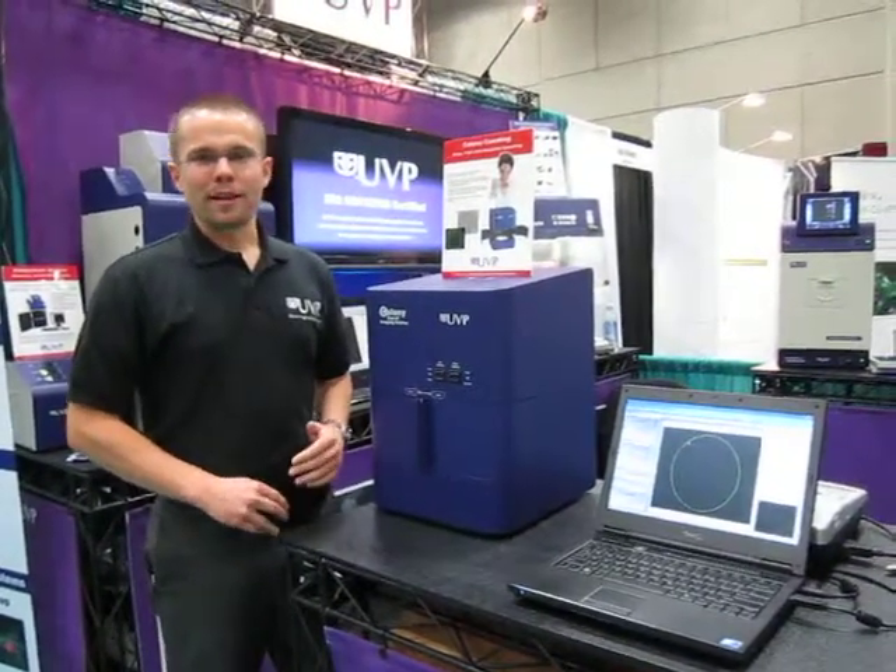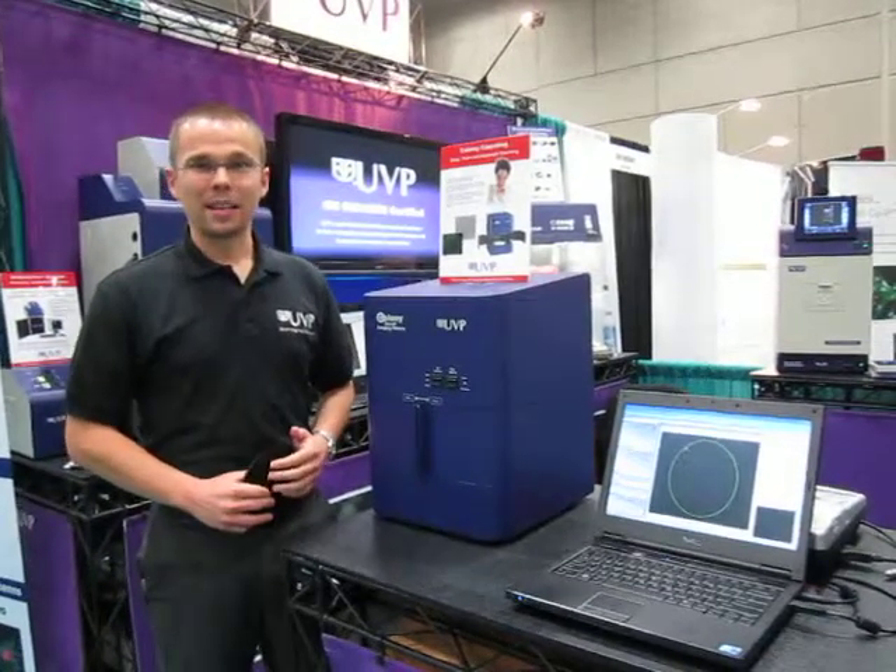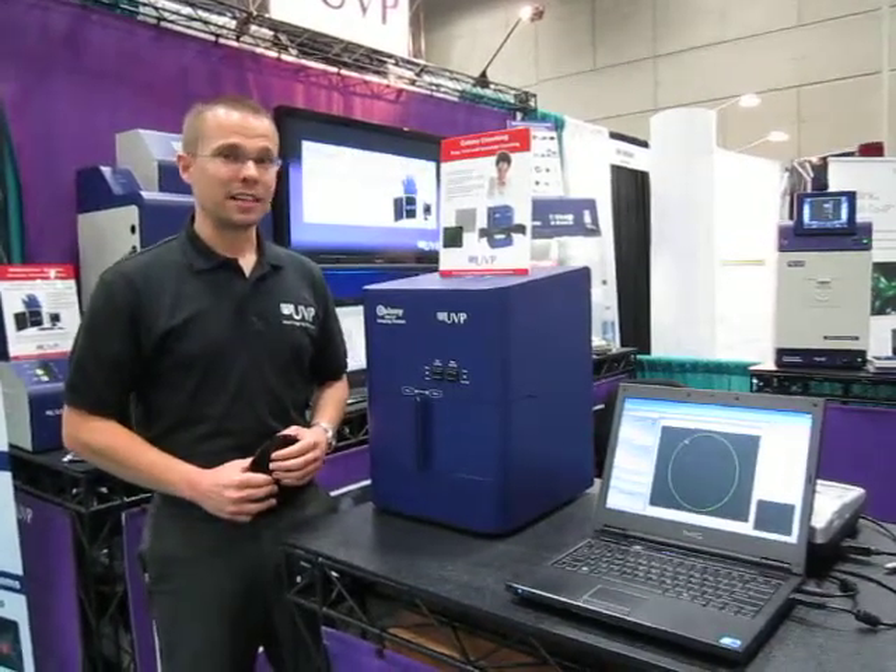Hi, my name is Mike Capps. I'm the product manager with UVP LLC from Upland, California. And today we're at the Experimental Biology Show in San Diego, California.